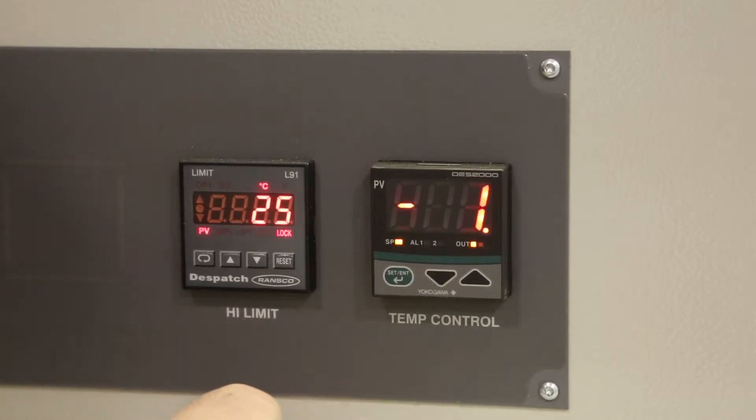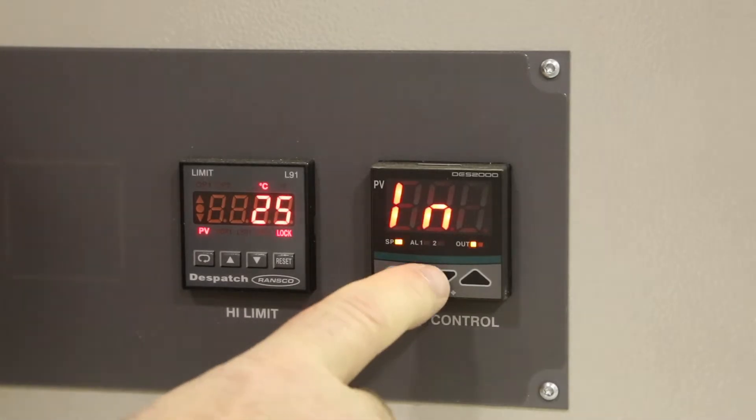Press the down arrow to change the value to minus 1. Press the green button and LN will be displayed.